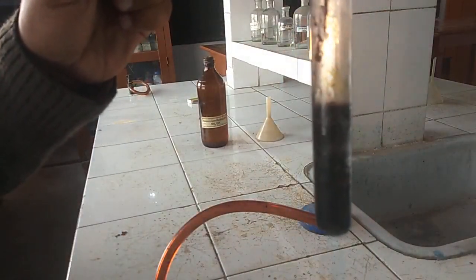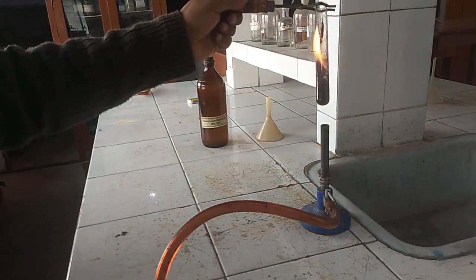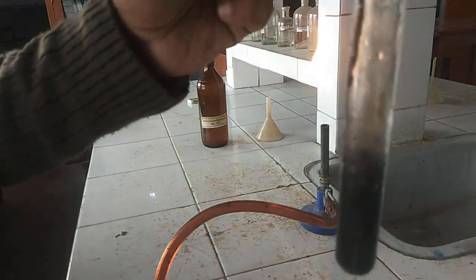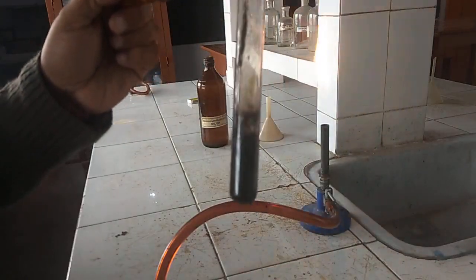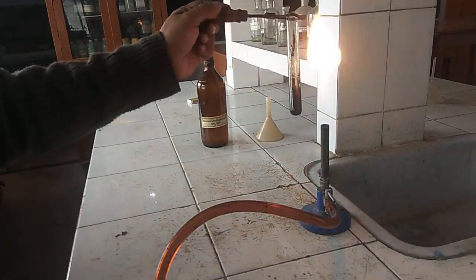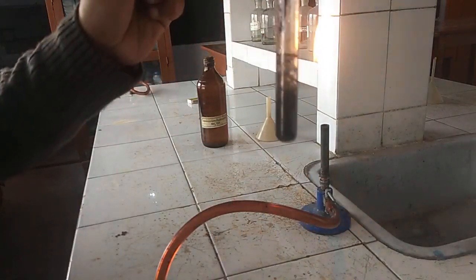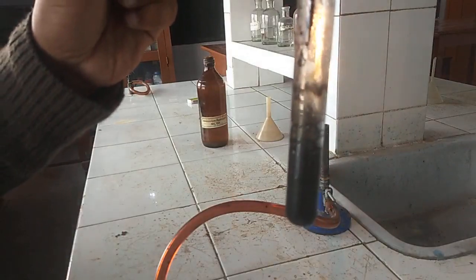The formation of a greenish yellowish deposition on the walls of the test tube confirms the presence of chloride ion in the salt. Chlorine gas evolved in this process and chlorine gas gives a greenish yellowish color. Whenever you are doing heating, you have to be very careful.